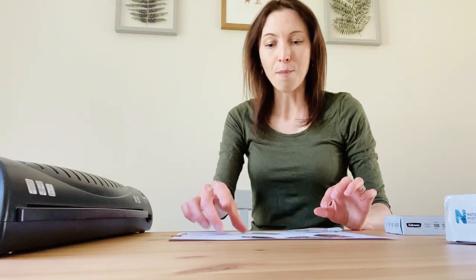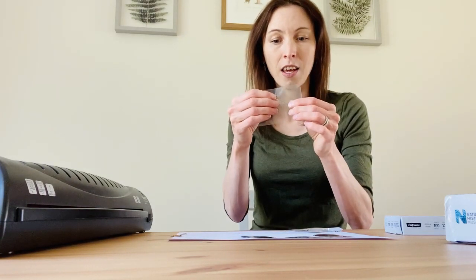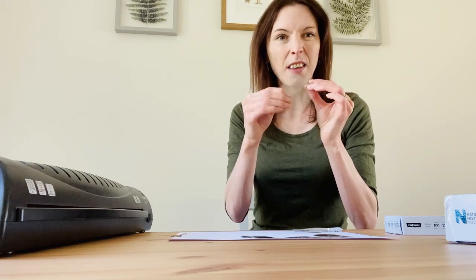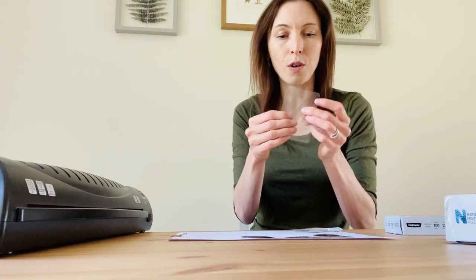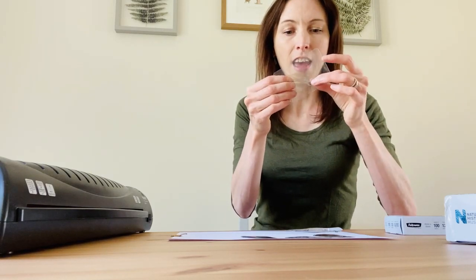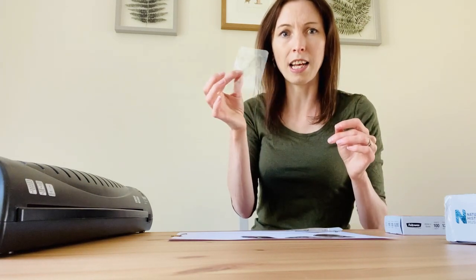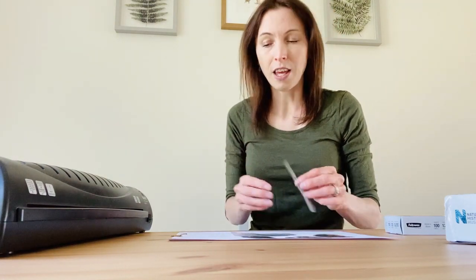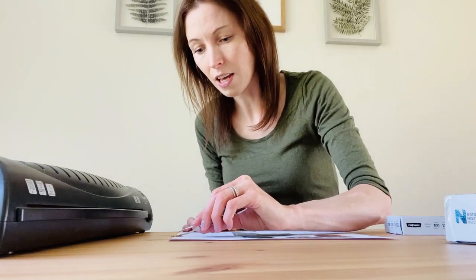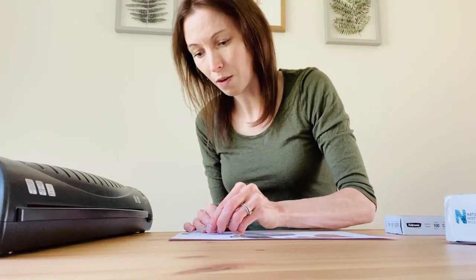They've been put into laminate — plastic — which is actually really good because it means they'll keep for ages and makes them quite robust, especially for little hands. Because once they're in there, even if you wiggle them around they don't snap and break, so it's quite handy to use with children. So I've got a couple of things to laminate today — I've got a painted lady butterfly wing.